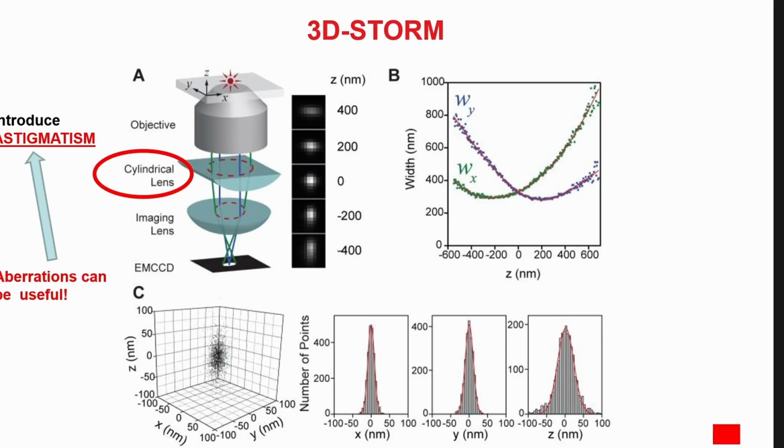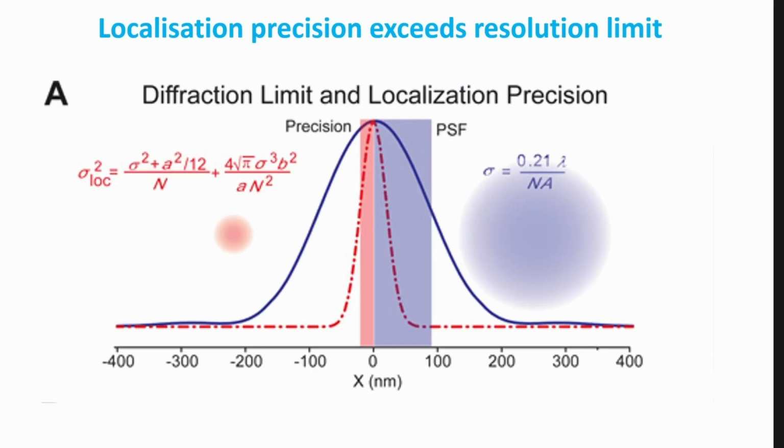That's what astigmatism does. So this way, you can get a signal in approximately, in this case, 800 nanometer range. So as I mentioned, approximately a micron thick layer. And if you have only 20 nanometer step size, then you have a 50 layer 1 micron thick Z stack. So we are talking about very, very small structures, individual molecules. Again, the diffraction limit is still there, so the individual spots are as they are, within the diffraction. But our measured fitted point spread function will be much narrower.